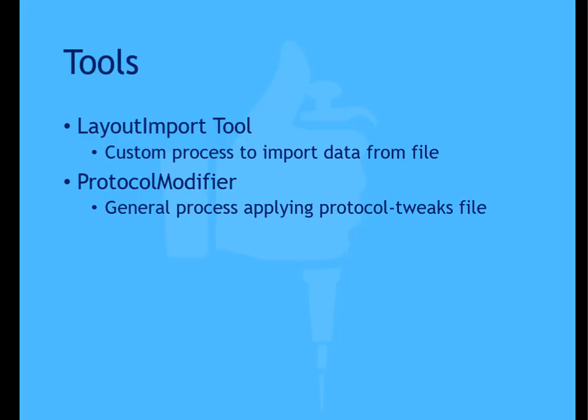The next tool we'll use is the ProtocolModifier tool. This tool creates a copy of the existing protocol and applies the settings in the specified protocol tweaks file, in our case, the imported layout. The protocol copy is saved and executed.